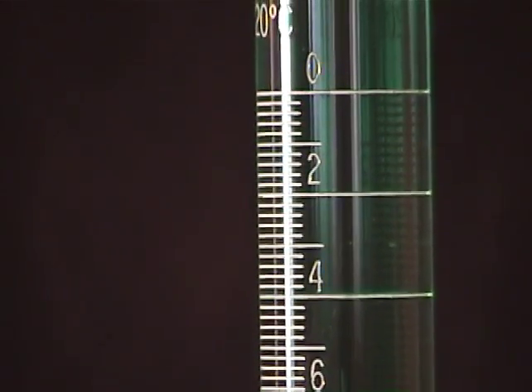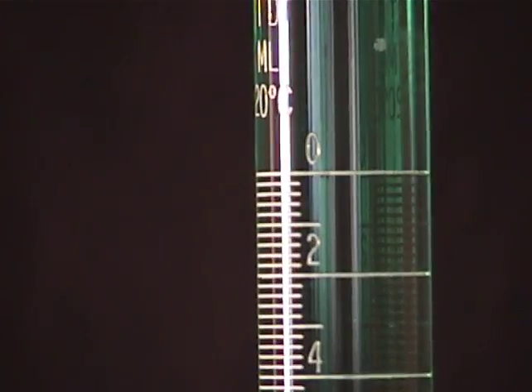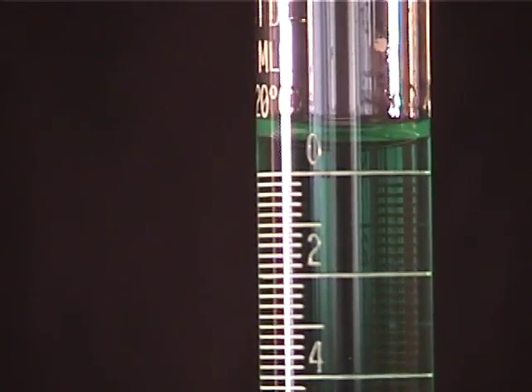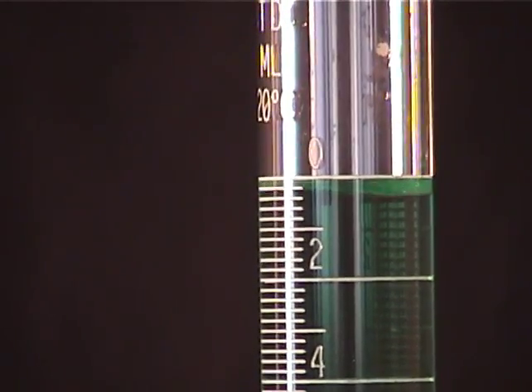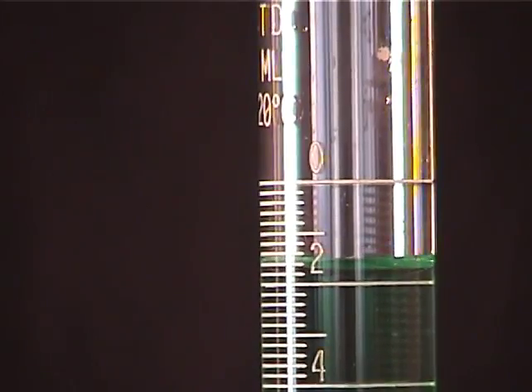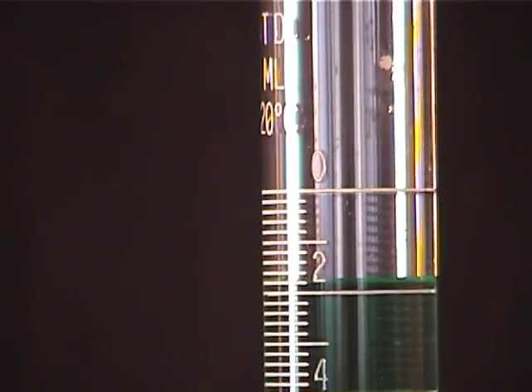To avoid parallax error, your view line also must be absolutely horizontal. Adjust the initial reagent level to anywhere between 0 to 2 milliliters. Hold your finger or a white piece of paper behind the burette to facilitate the reading and read from the bottom curve of the meniscus, estimating the hundredths place.